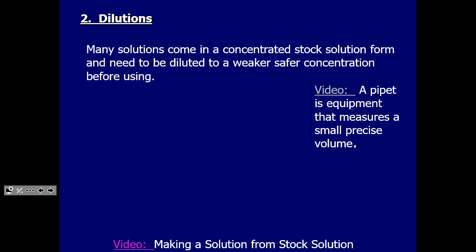So many of the solutions, or many of the ways solutions come, are as what are called stock solutions. So something like hydrochloric acid, right? Hydrochloric acid is hydrogen chloride gas dissolved in water, all right? HCl(aq), all right? And so they can't sell me the gas and then expect me to bubble the gas in the water and make the gas dissolve. That's a hard thing to do.